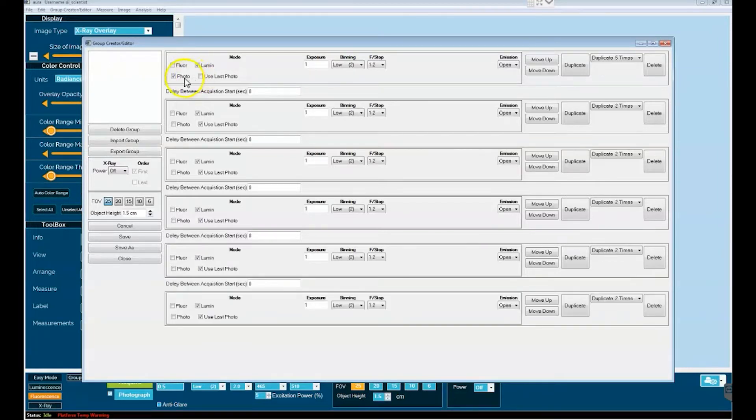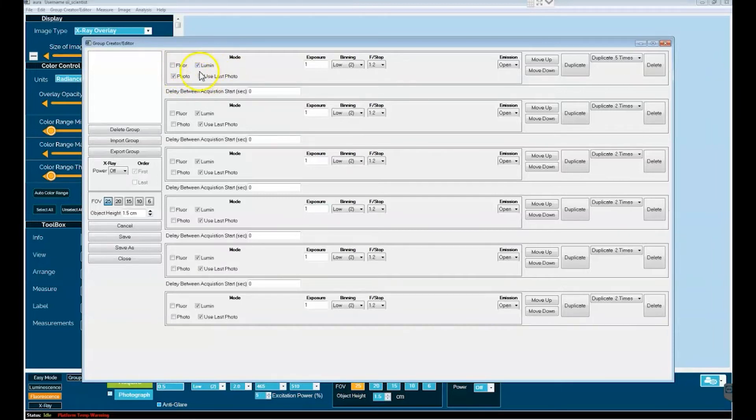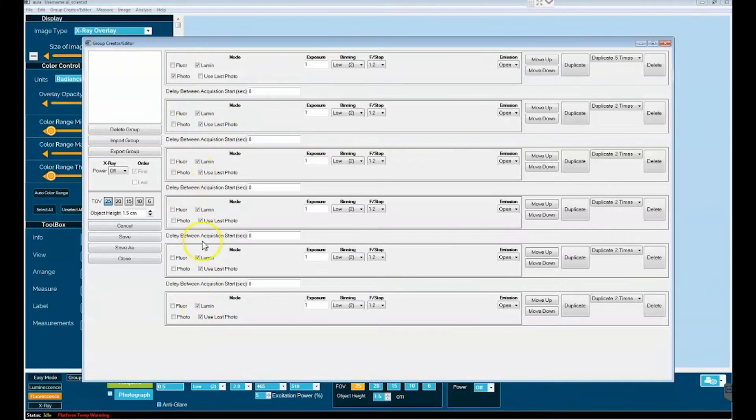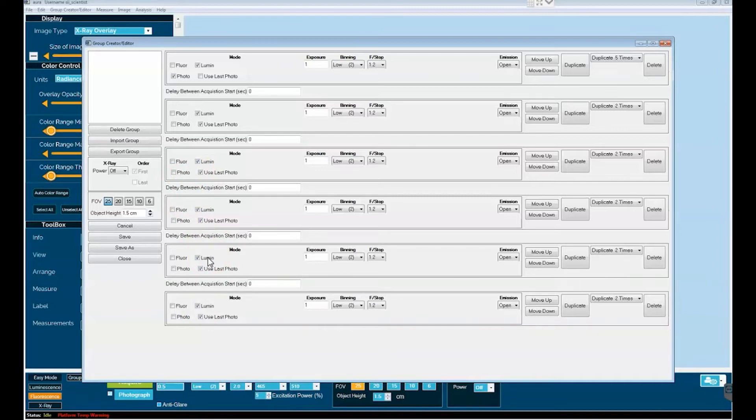Now, additional features here for Group Acquire can be seen in the left hand side of each camera ribbon. You have the option to do photo in the first acquisition and then to use the last photo for ensuing acquisitions, so as not to waste space with repeat white light images of your mice who aren't moving because they're underneath anesthesia.